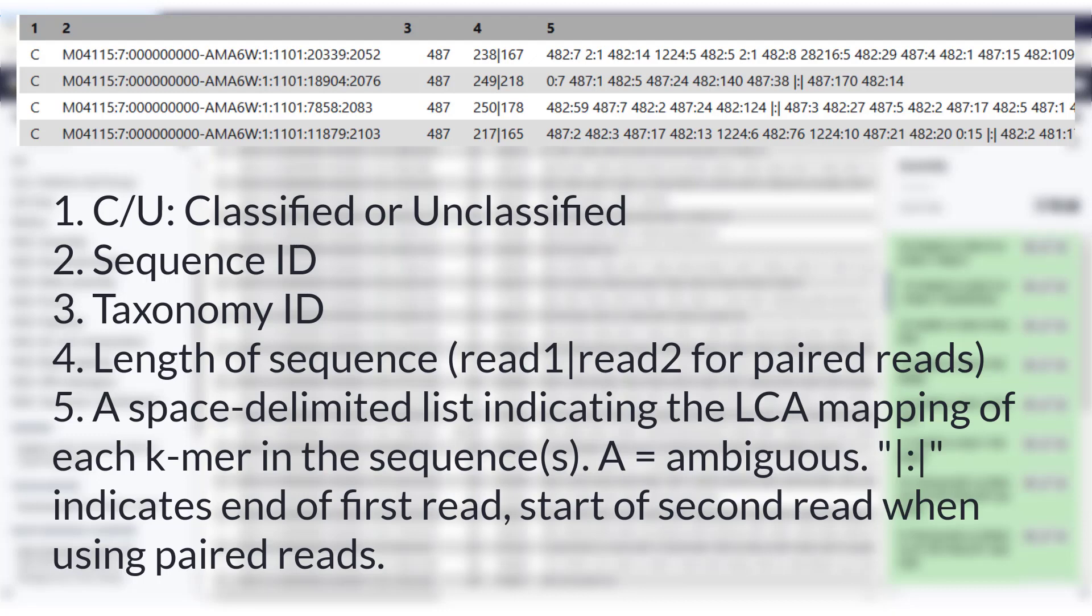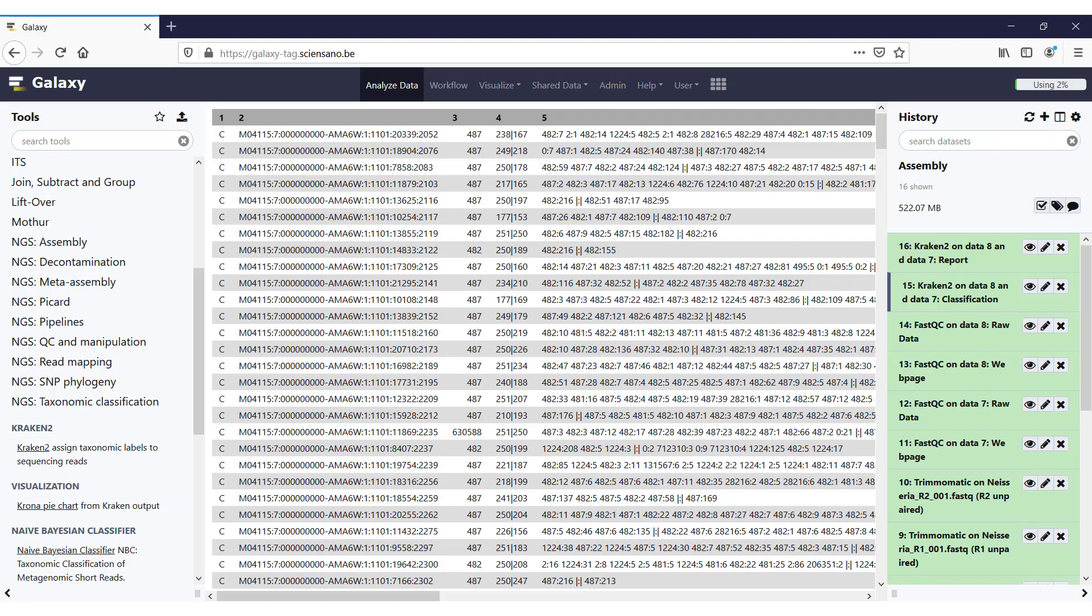And the fifth column shows you the mappings of the taxonomy. So in this case, if you look at the first line, it was seven k-mers assigned to taxon 482, one k-mer to taxon 2, 14 to taxon 482, and so on. And from this list Kraken will determine the best classification for this read. But as you can see, this is really hard to interpret.